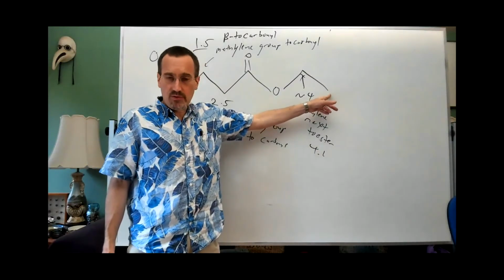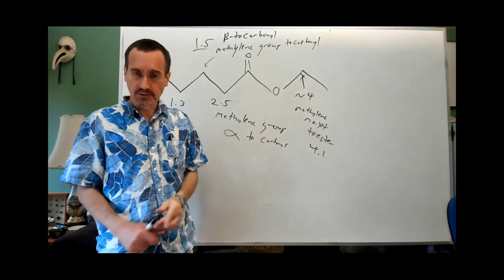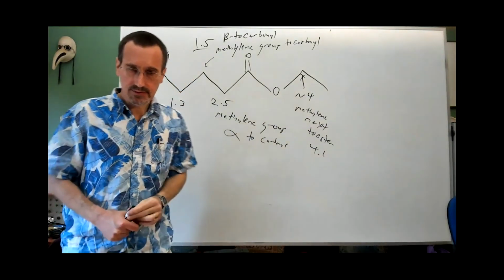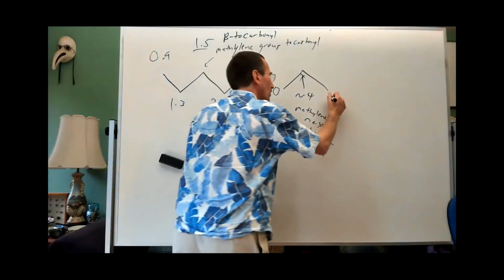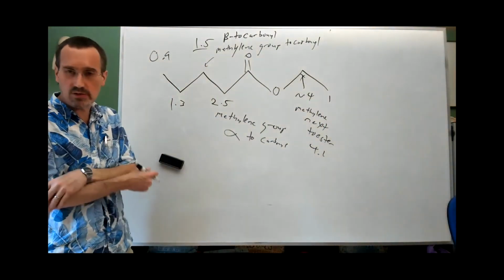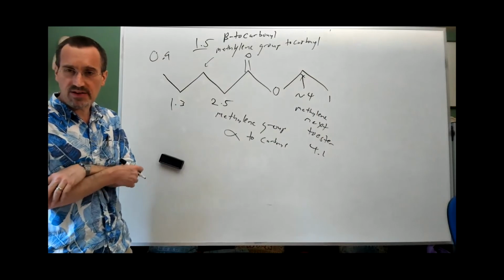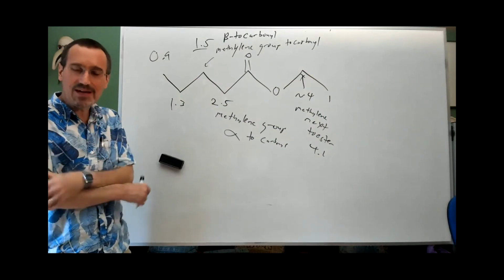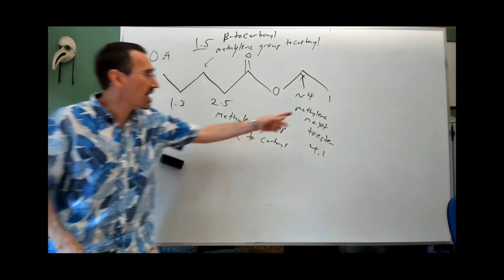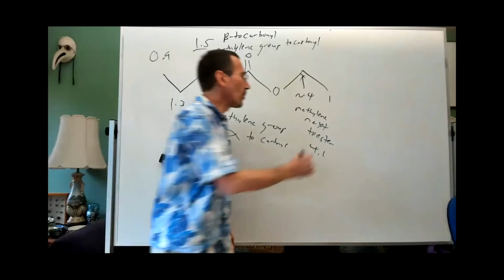What about our methyl group over here? About 1. Can we go a little further on that? Because 1 is kind of close to a vanilla methyl group. How do we describe this methyl group here? Around 1.2.